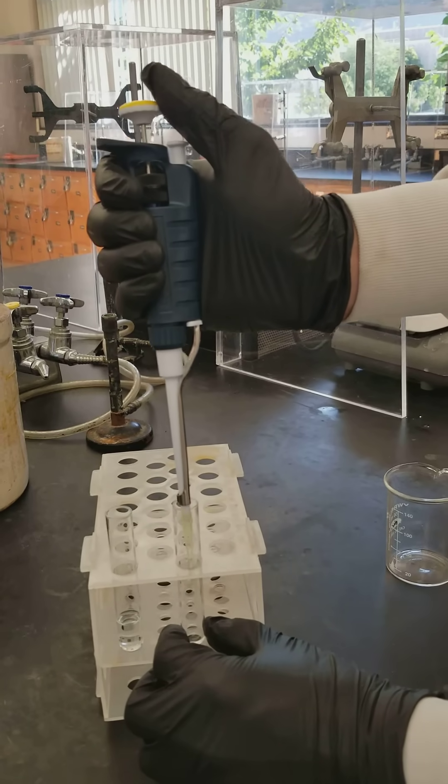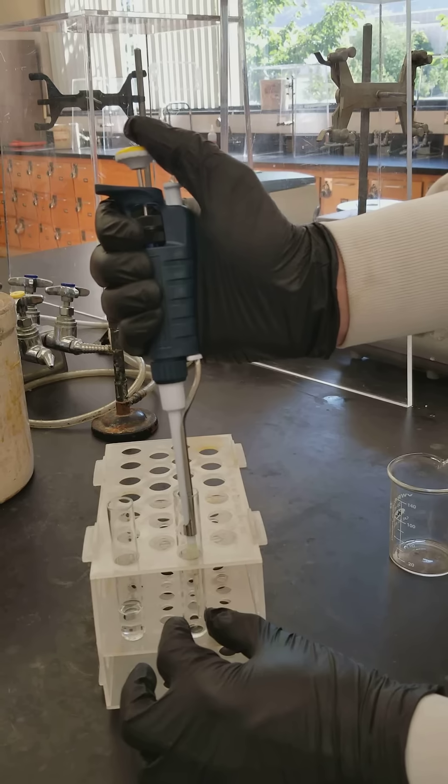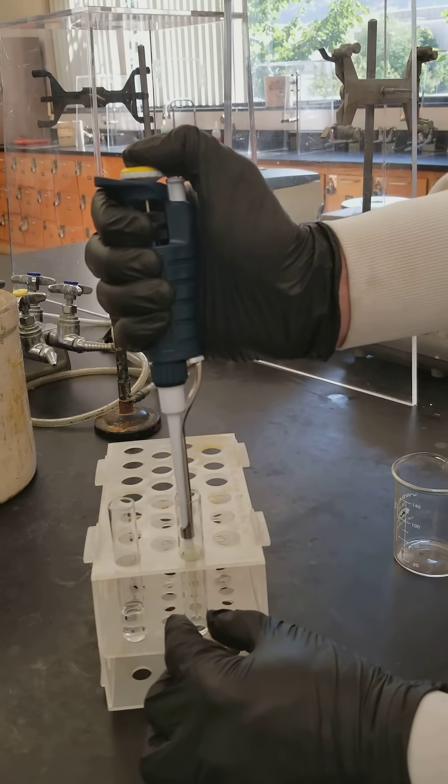Then you place it into the container you're going to transfer it to. You need to have the tip up against the side of the container. You press down to the first click and down to the second click in order to get out all of your liquid.